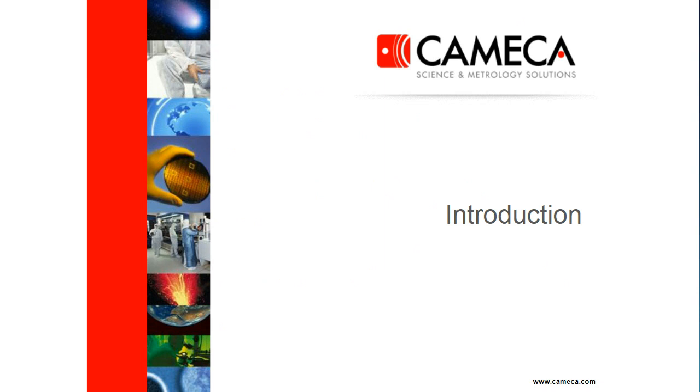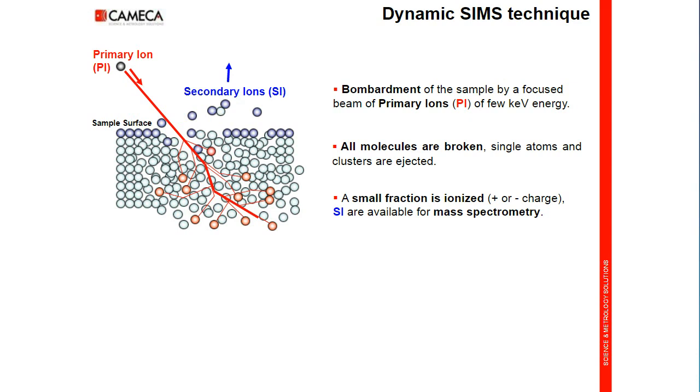A brief introduction to the dynamic SIMS technique and instrumentation. When a solid sample is bombarded by primary ions of a few keV energy, a fraction of the particles emitted from the sample surface is ionized. Secondary ion mass spectrometry, SIMS, consists of collecting and analyzing these secondary ions with a mass spectrometer.